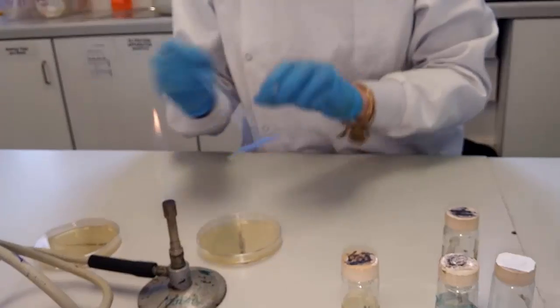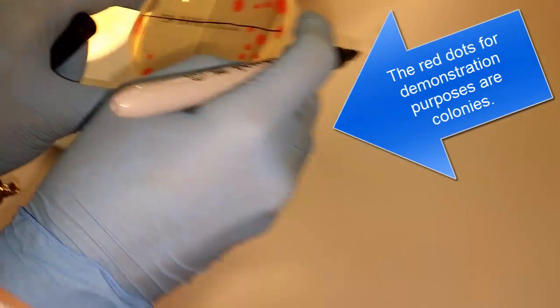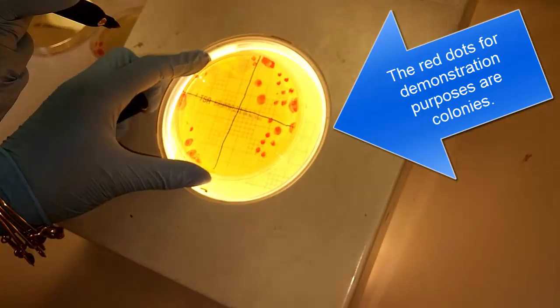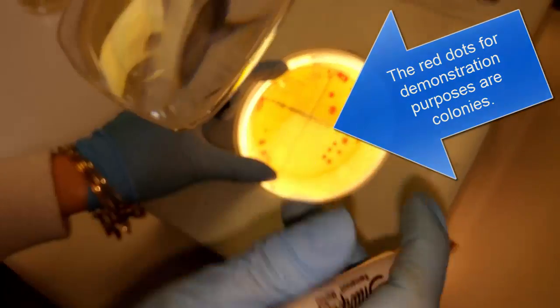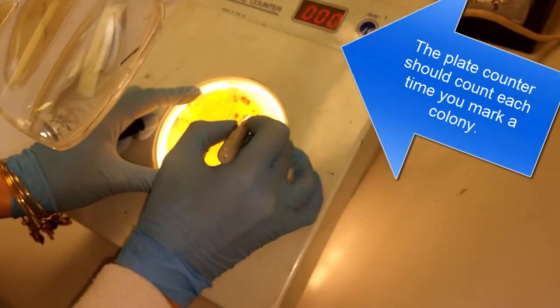Next, we will be counting the amount of colonies that have grown on the plates. Whichever plate value falls between 30 and 300 is the plate that will be used. To count the colonies, a counter will be used.